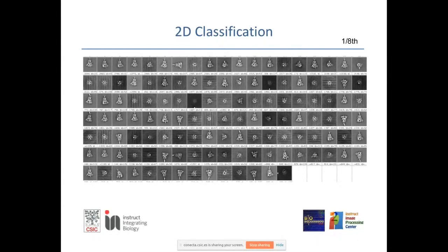And again, this was a change of mind for me, because normally I was very strict in the 2D classification. If there is a problem in the 2D classification, I was thinking that will drive the 3D alignment, and then I cannot use those particles for 3D reconstruction. But actually you can. If the pattern is not strong enough to drive the 3D alignment, then these particles can be used.